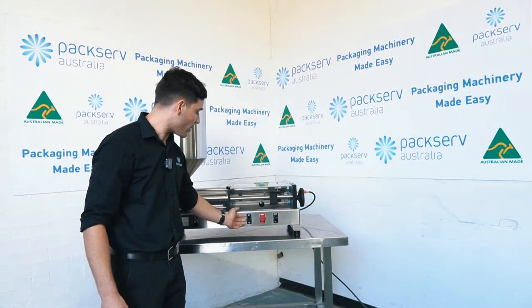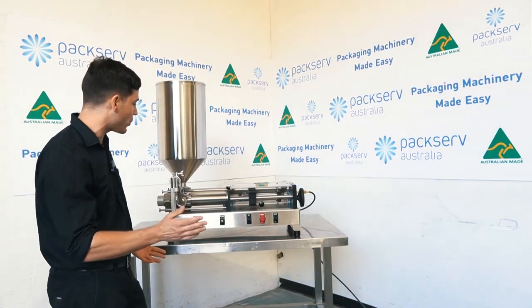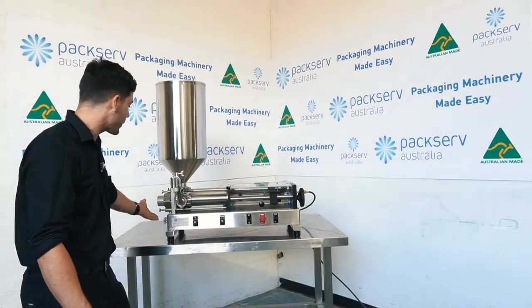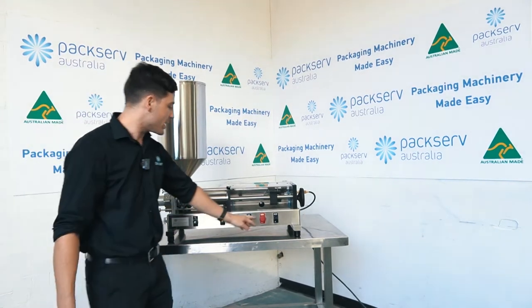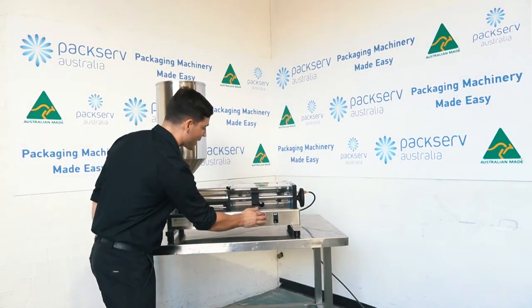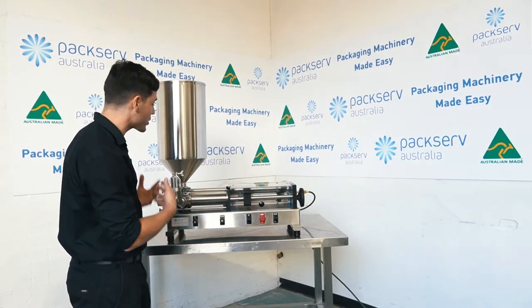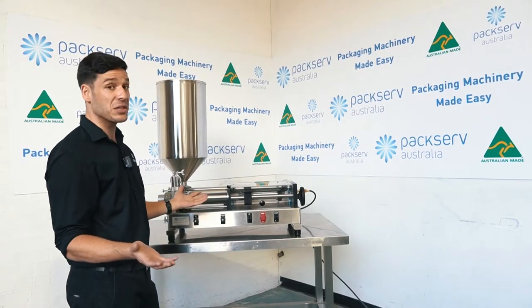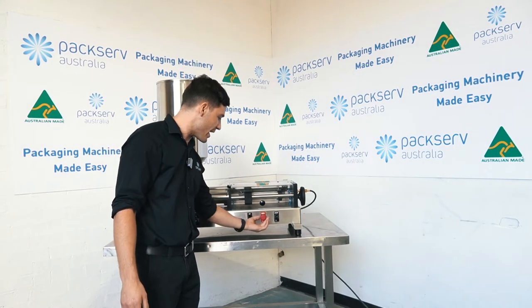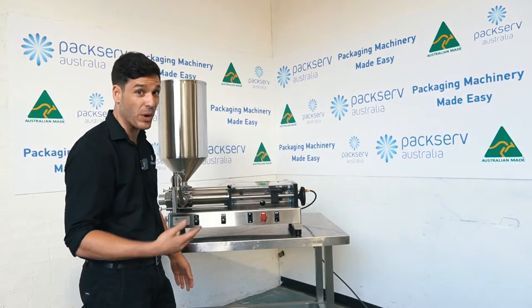You've got the off and on button here, just a toggle switch. If I switch this to on, the machine will just constantly run backwards and forwards. If you're using a foot switch, you'll have this set to off and every time you initiate the foot switch, that will get the machine to operate. Next, we have the emergency stop button. If I run this and I haven't got my container in place in time, I can hit this and it will turn the machine off, just to prevent excess product going on the floor or in any bad situation. Every time you engage this, make sure you flick the machine back to off and then release it. If you try to release the emergency stop while the machine is still on, it will start to operate again.